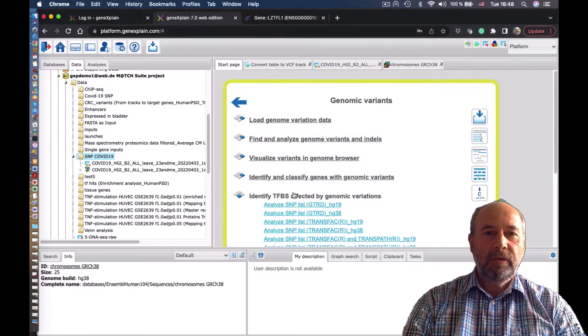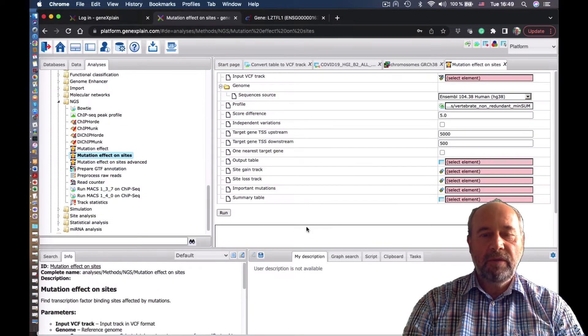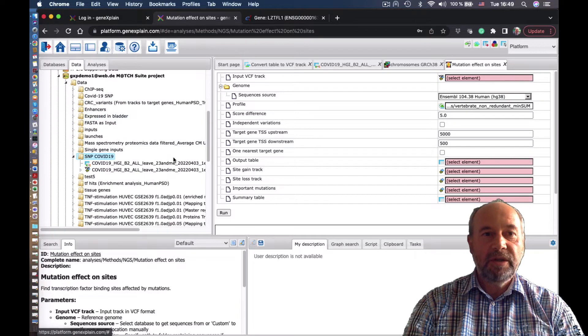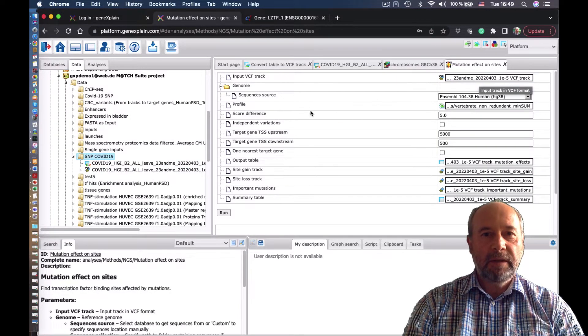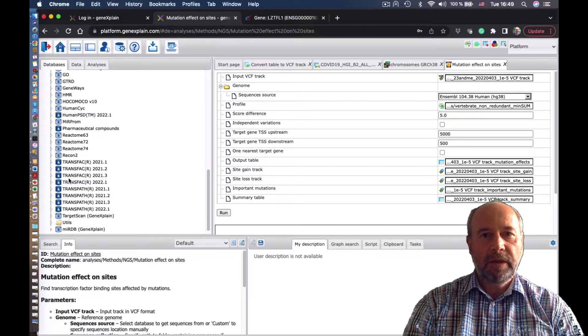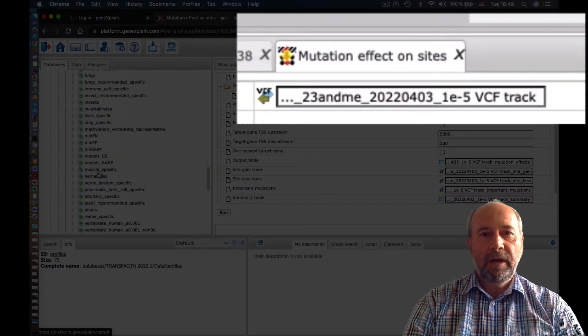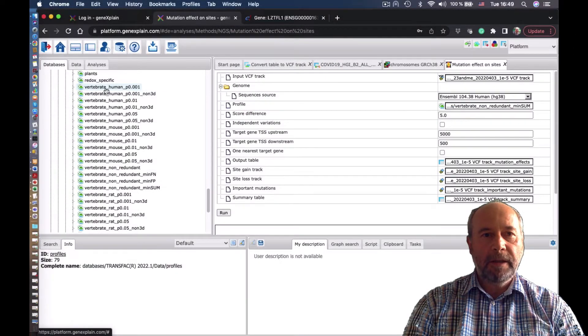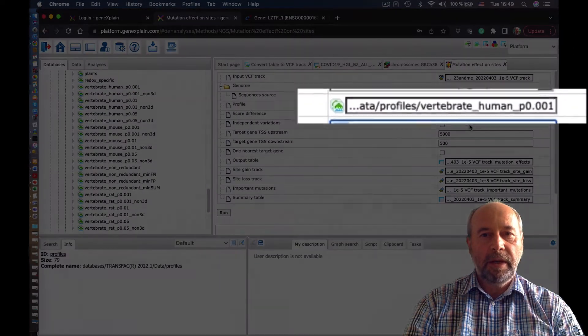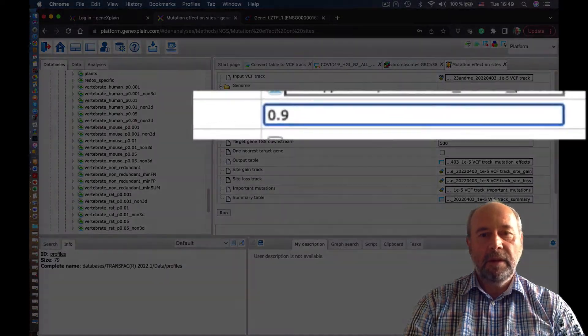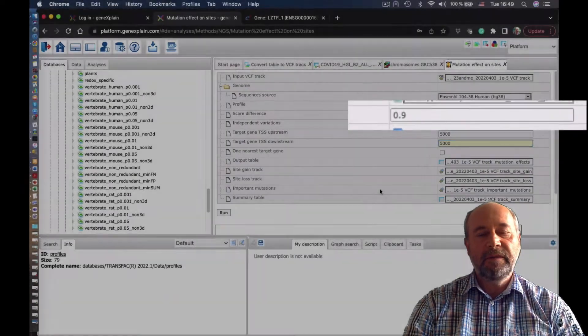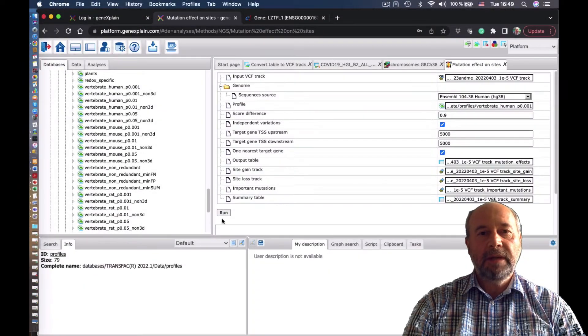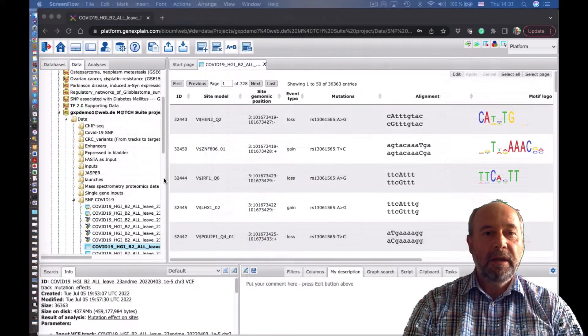Next, we want to analyze this SNP by searching for binding sites for transcription factors which are changed by this SNP. To do that, we start this program called Mutation Effects on Sites. We put there the whole profile from all library of Transfac. We set a cutoff, basically checking what is the difference between the binding sites before the SNP and after the SNP and run the analysis.